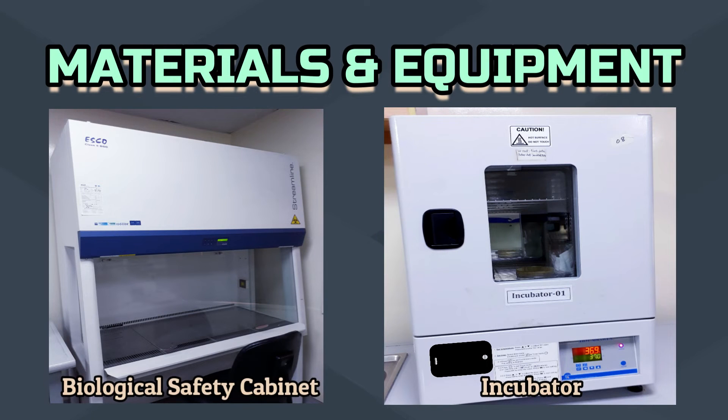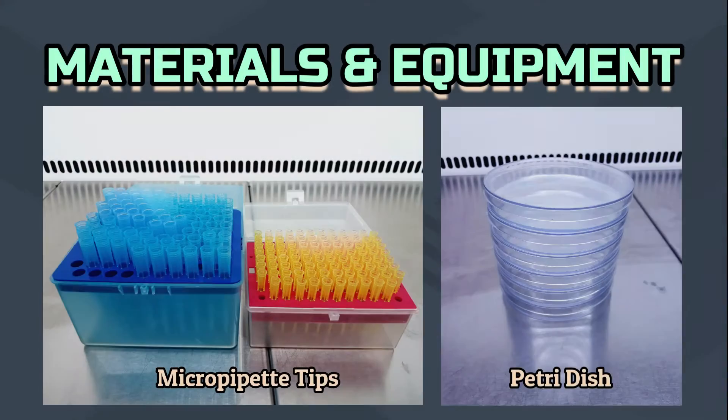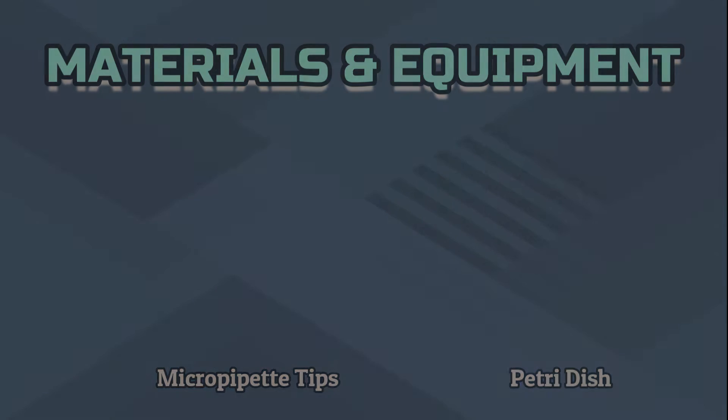To perform this method, we need a biological safety cabinet, incubator, micropipette, vortex mixer, micropipette tips, and petri dish.